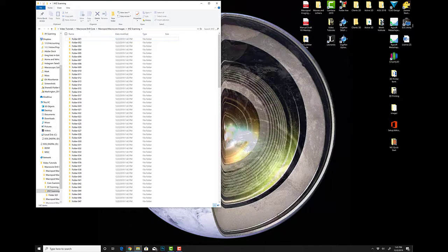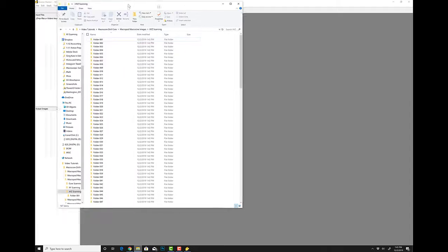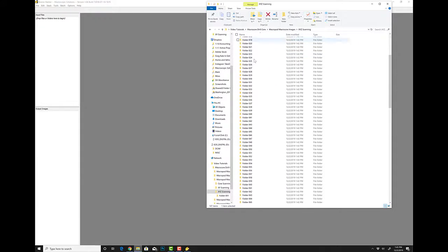And now it's time to go to Zerene Stacker and make sure that all these images are stitched together so that we're getting a high clarity output image that's completely in focus on every single frame across this core sample. The following step after that is to merge them together. So we're going to open Zerene Stacker again. We're going to go back to that folder. Instead of dragging and dropping, we're going to batch process these, so that it takes care of everything for you. So we're going to go to batch, show batch dialog.